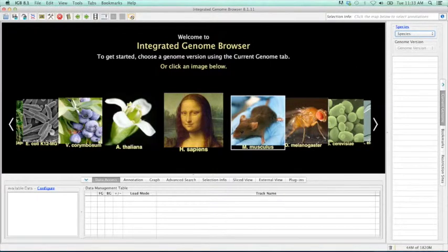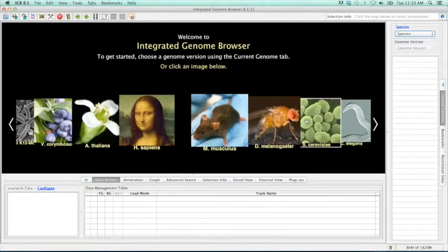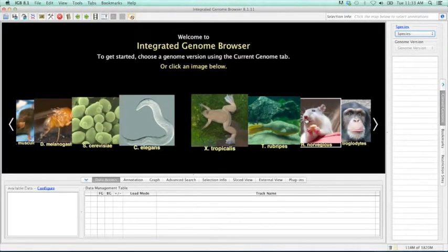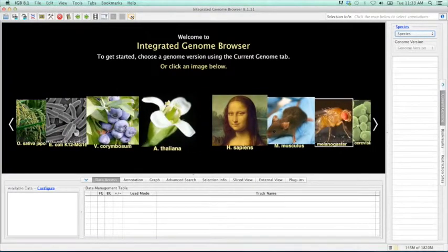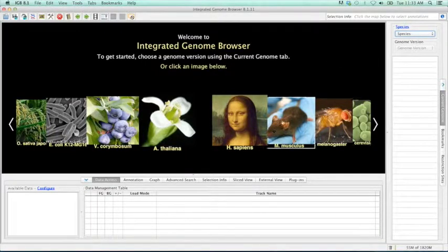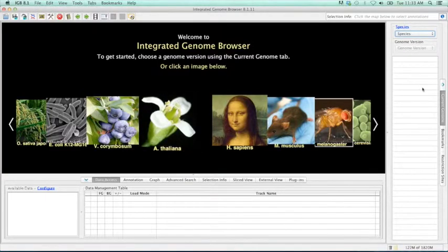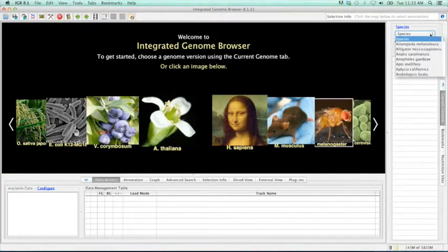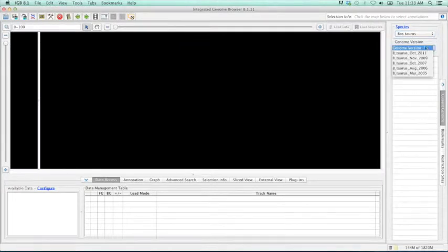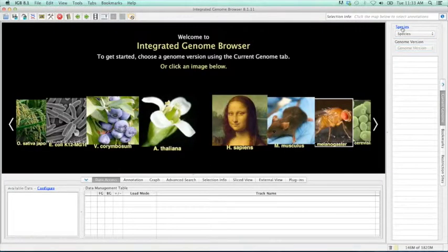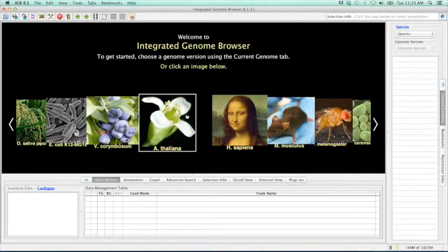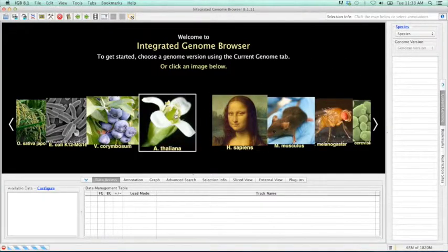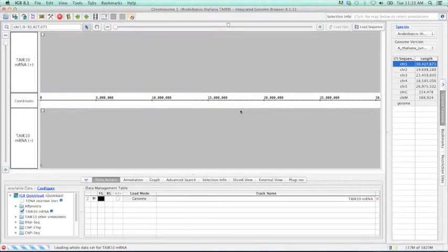As you can see, IGBI offers access to all current genomes and the various versions of each of these genomes. In order to select these genomes, you can either select through the carousel or through the species drop-down menu. For today's example, we will be using Arabidopsis, so I will go ahead and click and load the latest genome version.